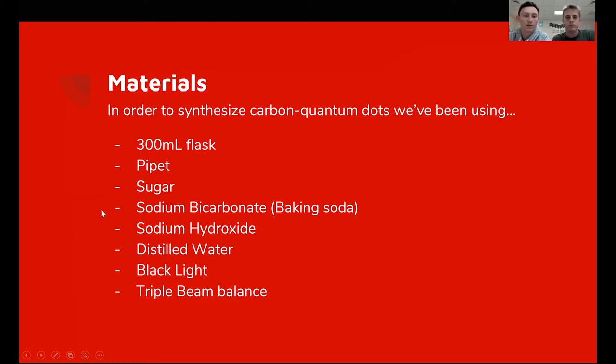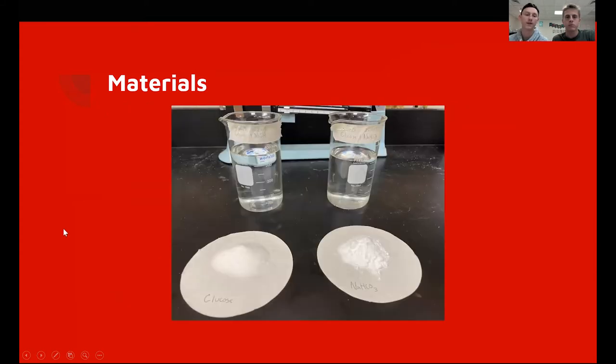sodium bicarbonate, sodium hydroxide, distilled water, a blacklight, and a triple beam balance. And then here's our setup with our glucose and our sodium bicarbonate, and then with our flasks and our balance in the back.